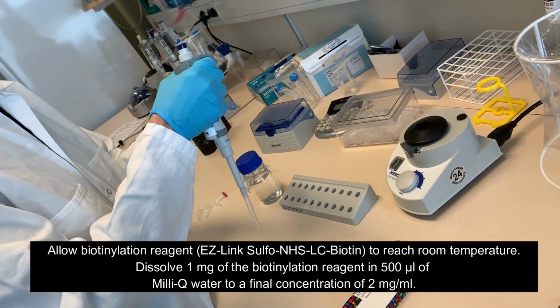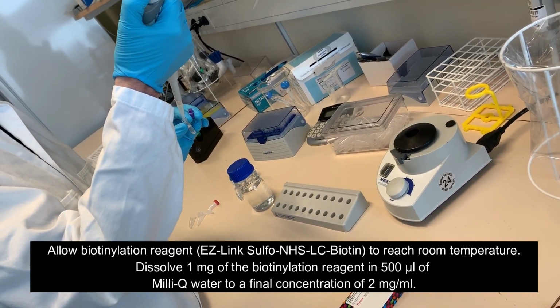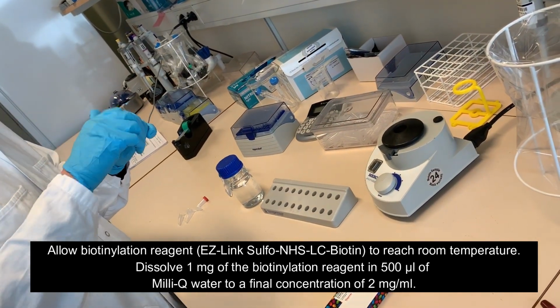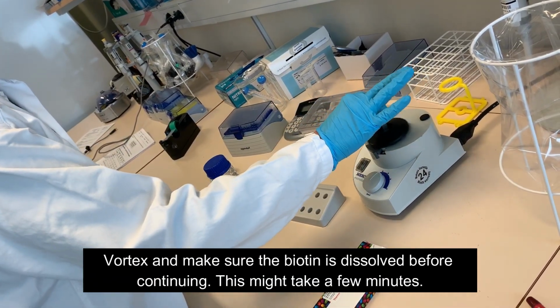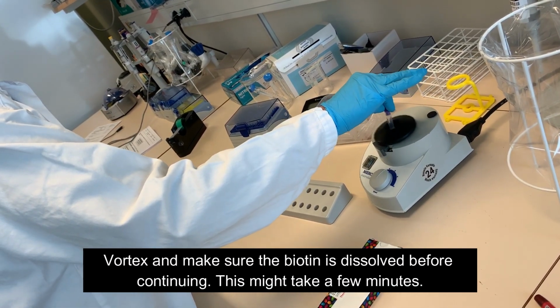Allow the biotinylation reagent to reach room temperature. Dissolve 1 mg of the biotinylation reagent in 500 microliters of Milli-Q water to a final concentration of 2 mg per ml. Vortex, and make sure that the biotin is completely dissolved before continuing to the next step. This might take a few minutes.